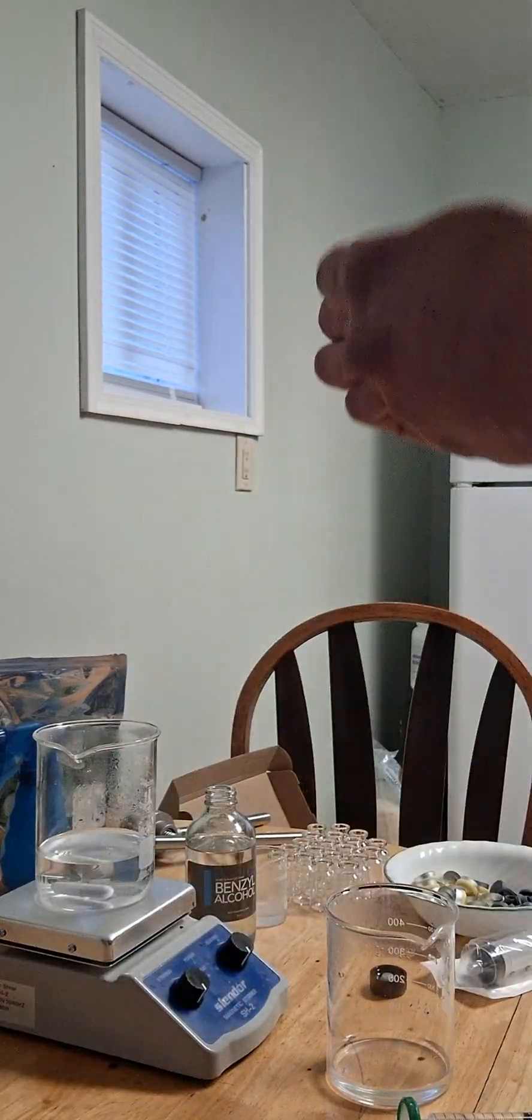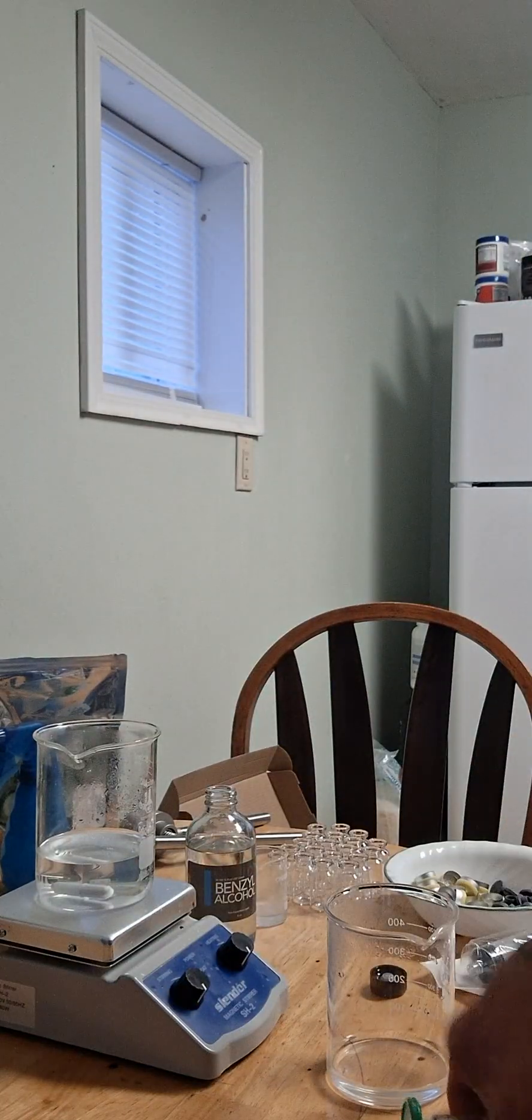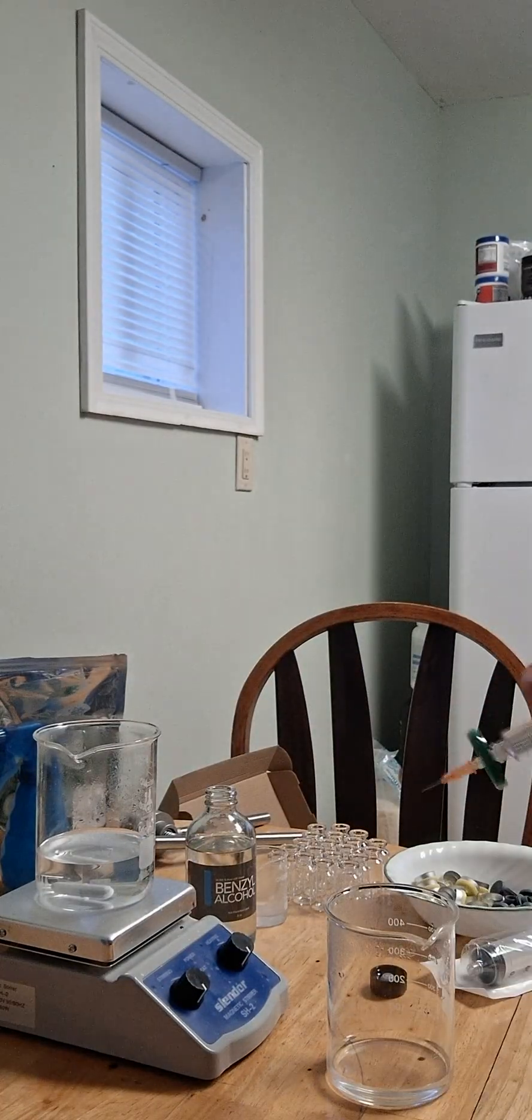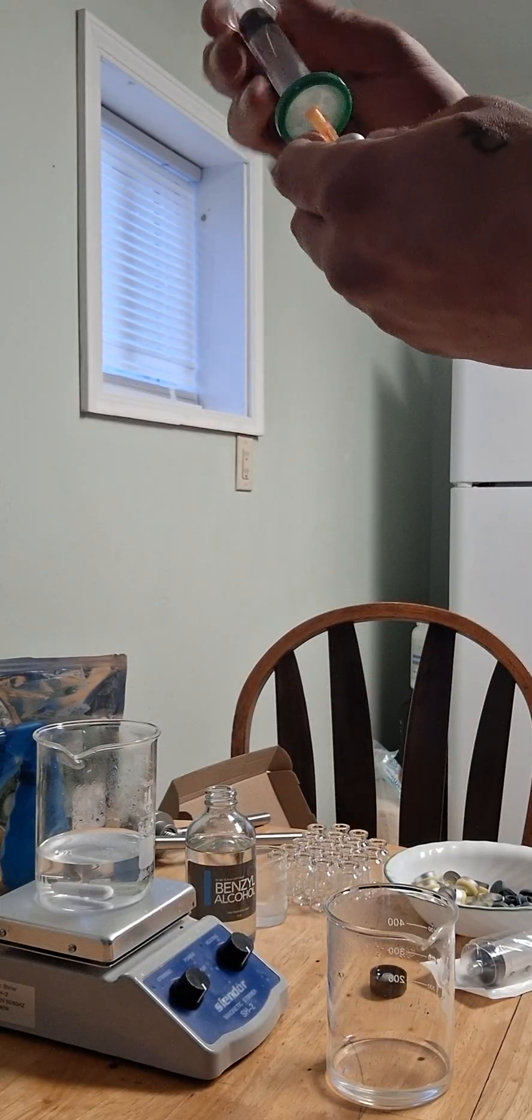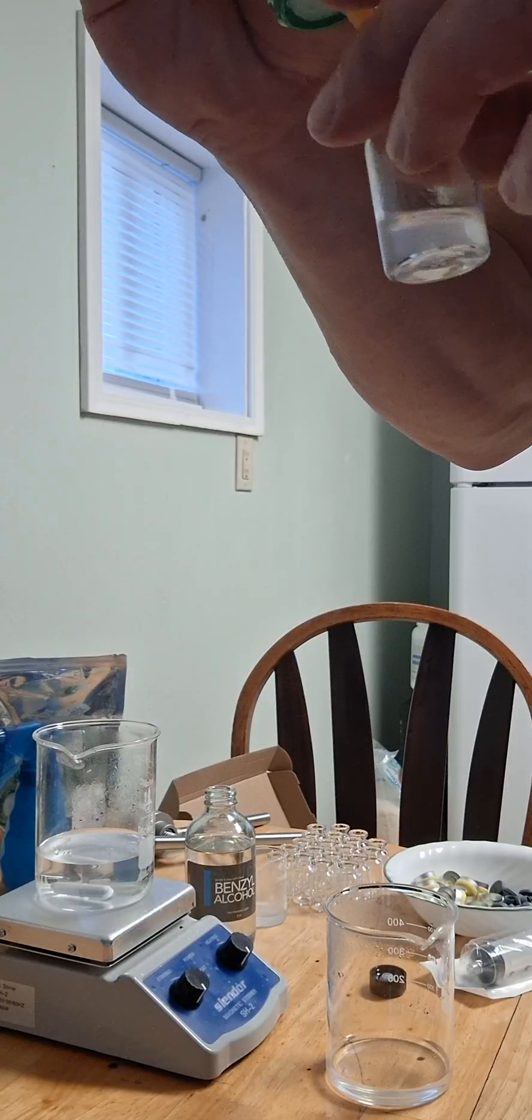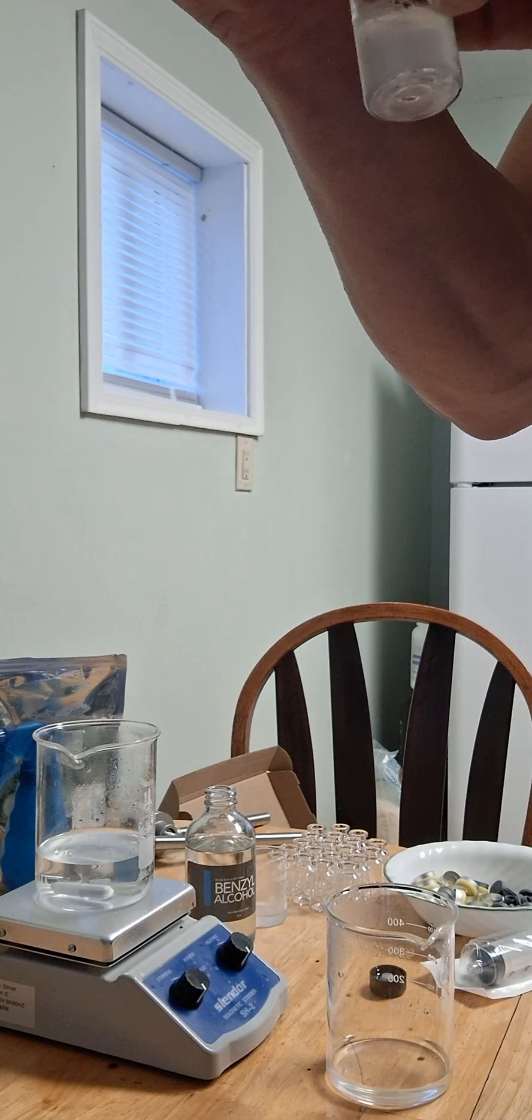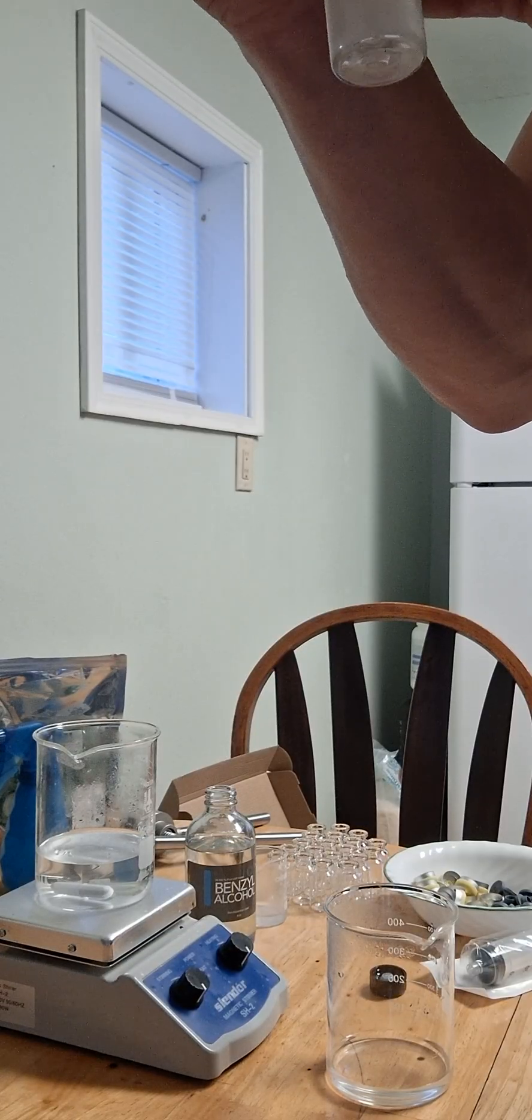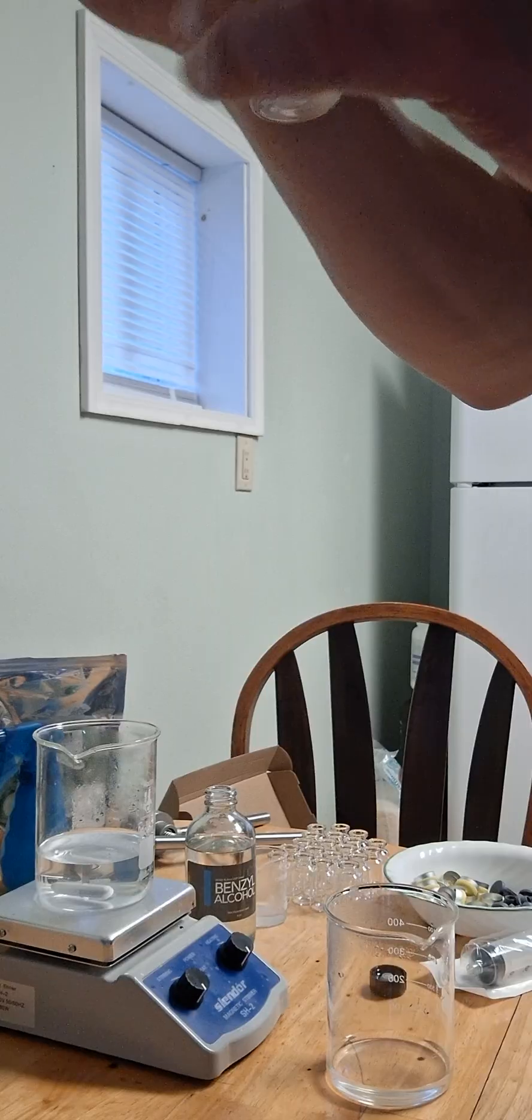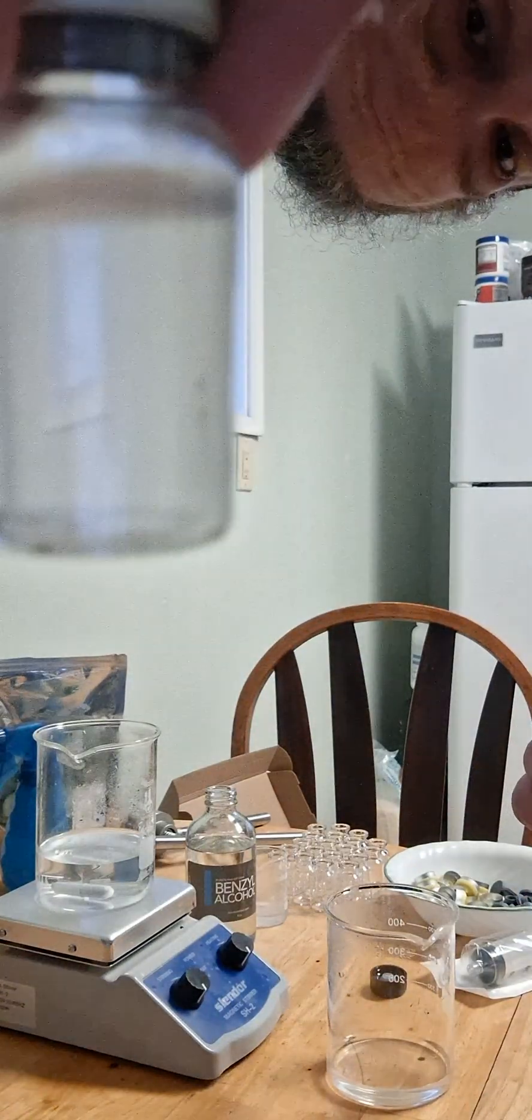And take another syringe tip and put it on the end of this, and you would simply insert it into the vial and push through. And it is filtering out any contaminants, any bacteria, as it's filtering. Take that out. It's still warm, so it's kind of... but yeah, there you go.